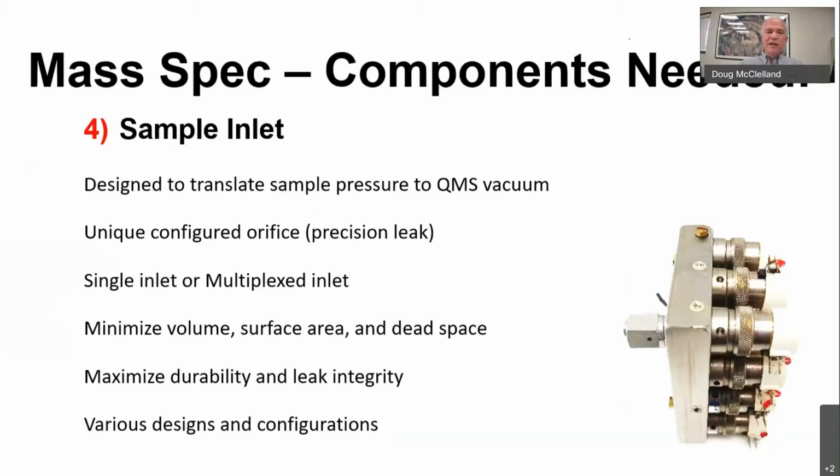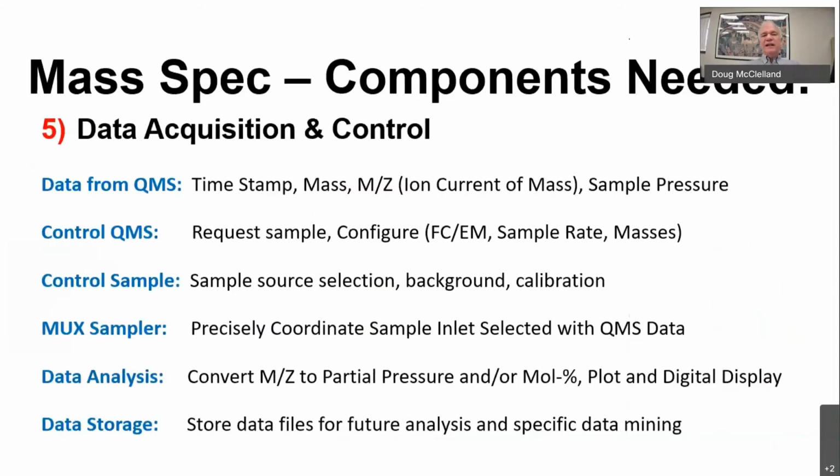Lastly, I want to talk about the data acquisition and control system. This is the software that manages the mass spec itself, tells the mass spec what its configuration is, and receives the data from the mass spec.